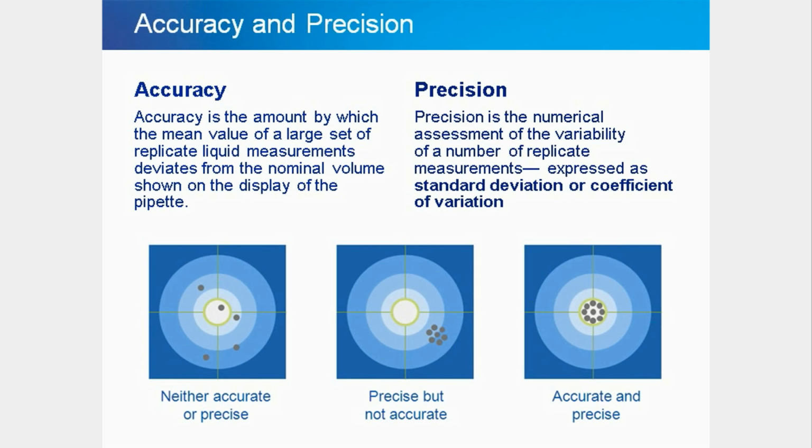Precision is the ability of the pipette to provide reproducibly similar dispenses. A typical precision specification for air displacement pipettes is about 1/3 to 1/4 of the accuracy specification. Precision is often referred to as repeatability or sample reproducibility, and also as standard deviation.